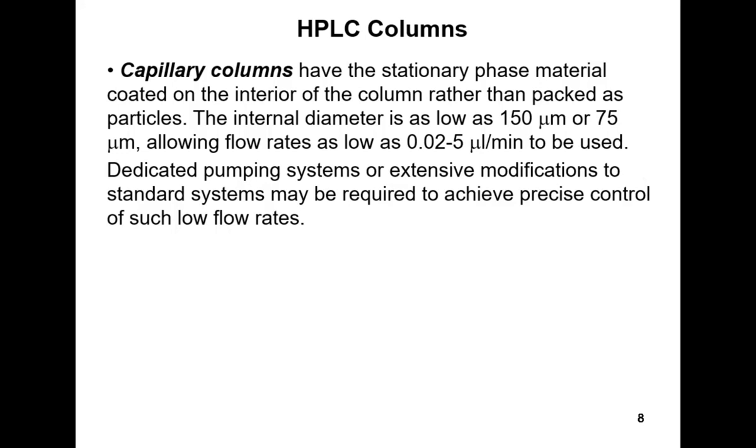It's coated on the inside of a narrow capillary. So you have an open space in the middle of the capillary that the mobile phase passes down, and the sample molecules are interacting with the walls of the capillary as they pass through it.